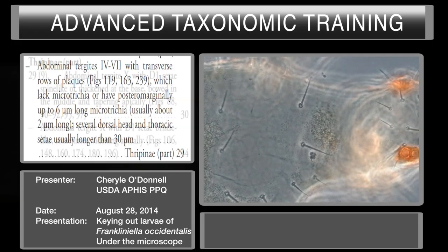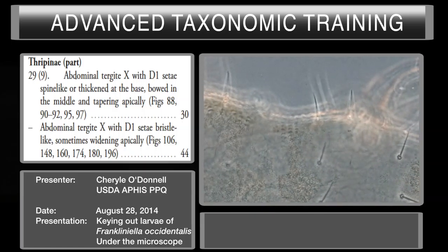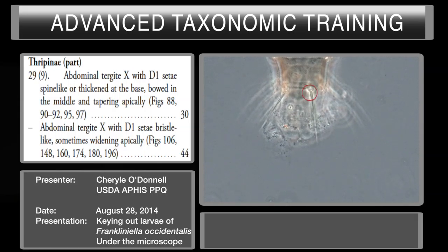Couplet 29 is on page 119. The first part asks you to look at abdominal tergite number 10. The couplet asks if the D1CD is spine-like or thickened at the base. It's not really spine-like — it's more lancet-shaped, thicker at the base but long and thin, more like a sword or a spike. So this is actually the second part of the couplet: abdominal tergite 10, D1CD bristle-like, sometimes widening apically but not in this case. This takes us to couplet number 44 on page 121.